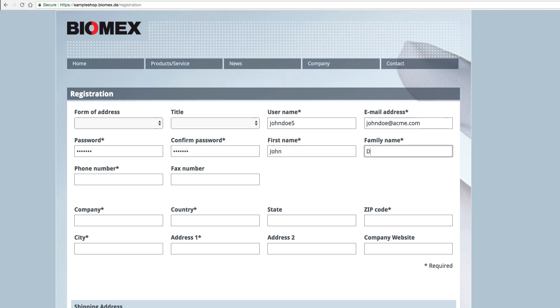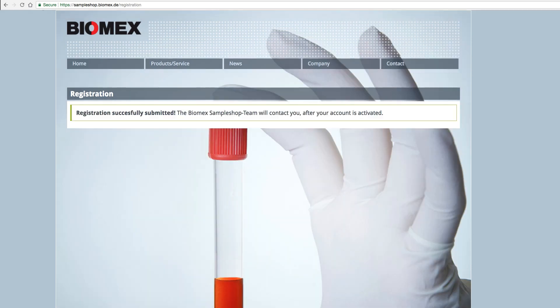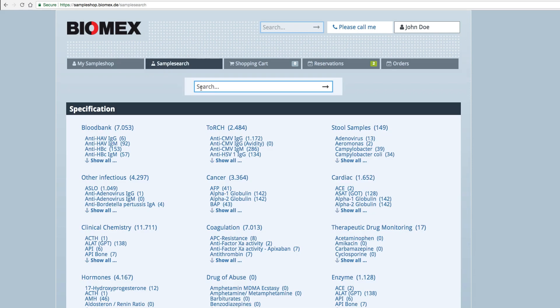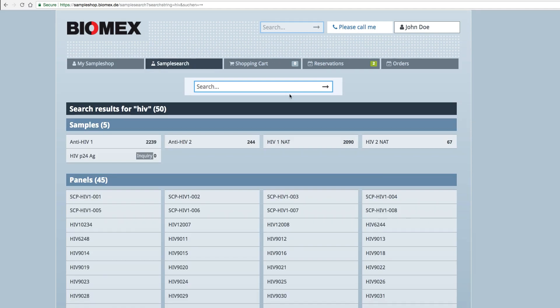After successful registration, your account will be released by the Biomex Sales Team and you will receive a confirmation email. Start your search with the Sample Search button, browse through the categories or search your samples by typing in the requested analyte.